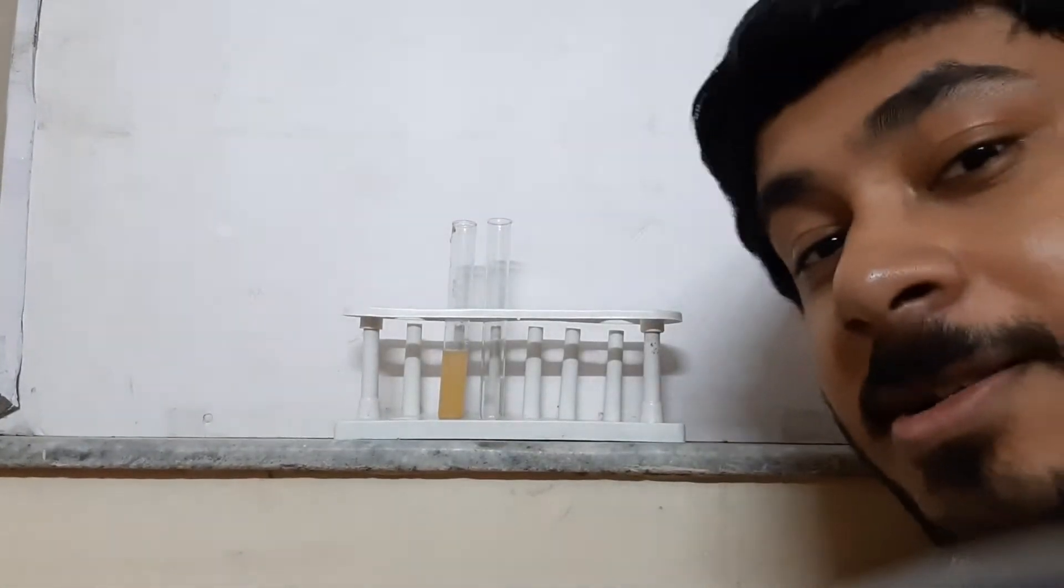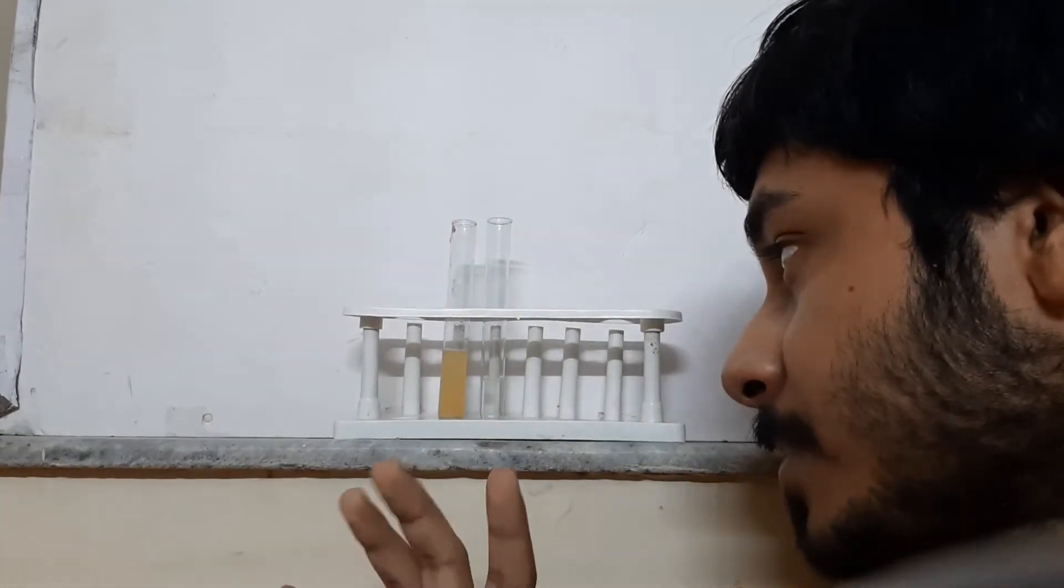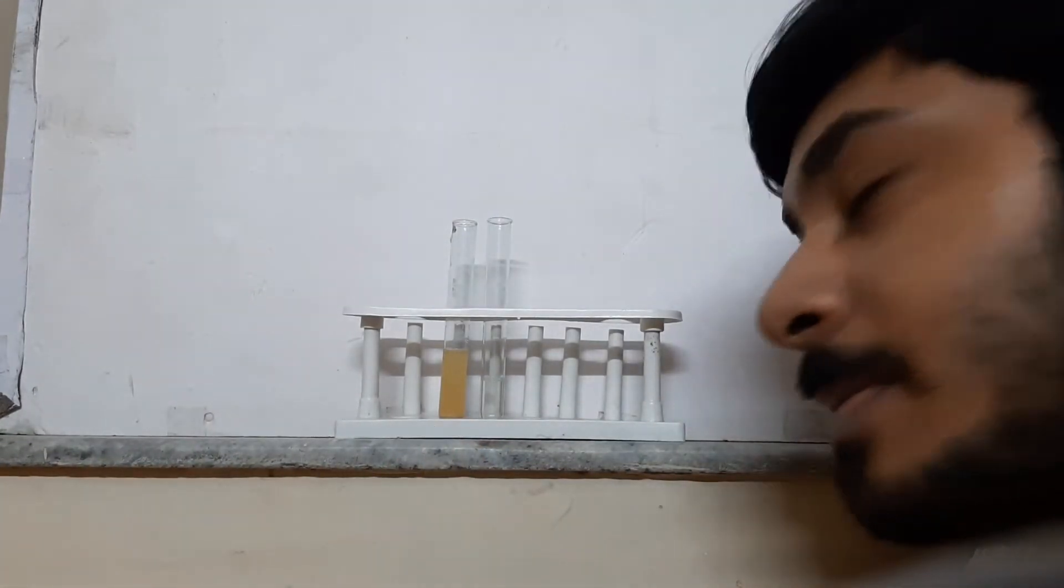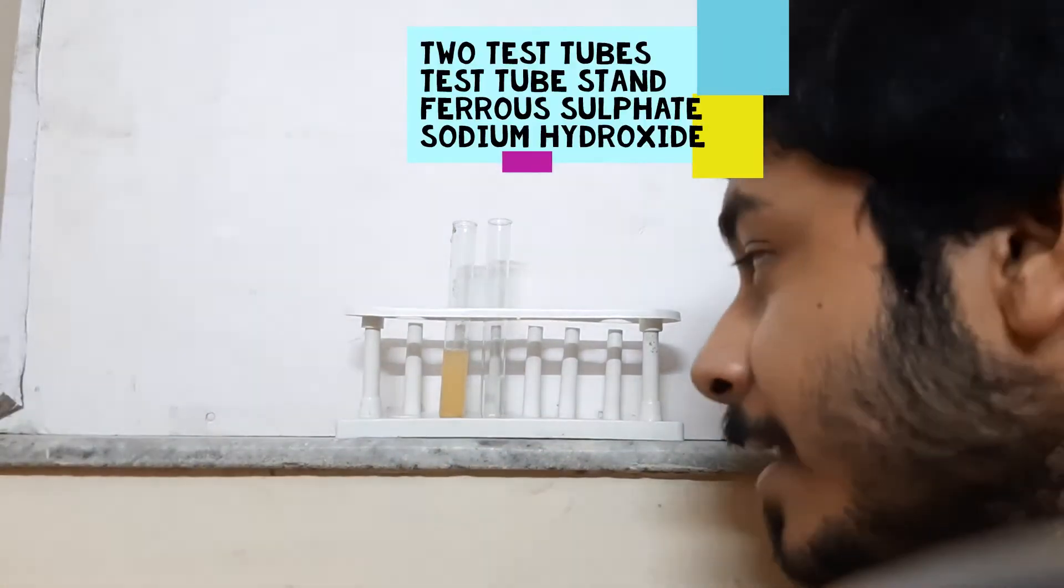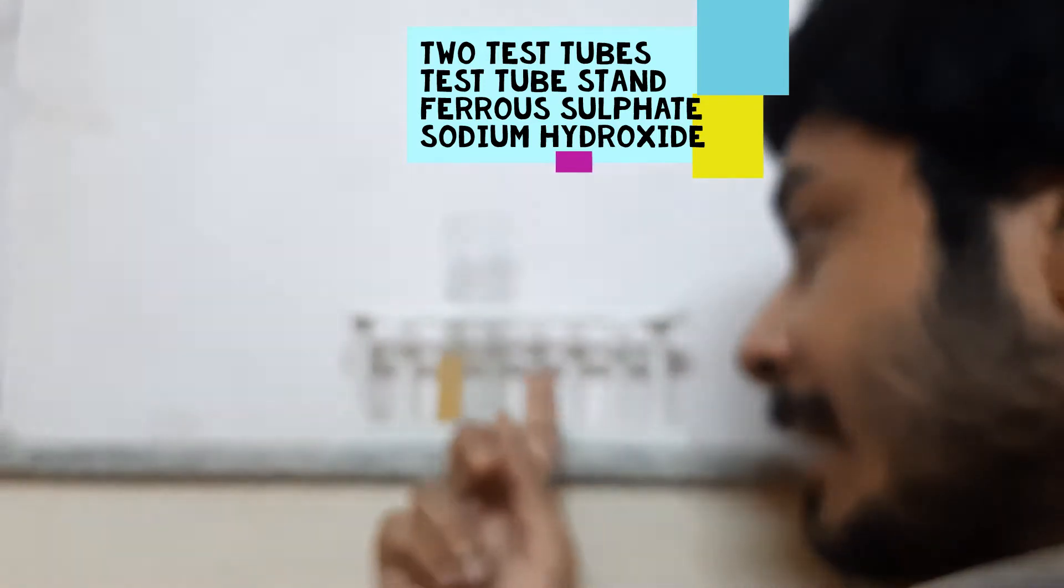Let me explain the apparatus - it's very simple. I have two test tubes in a test tube stand: the first one has ferrous sulfate and the second one has sodium hydroxide.